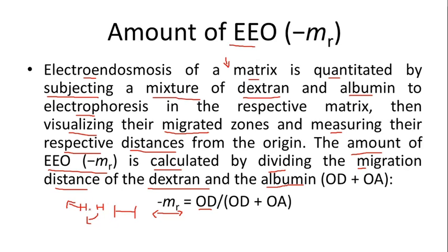So please keep in mind, if the electroendosmosis value is low, the corresponding matrix is low electroendosmosis.